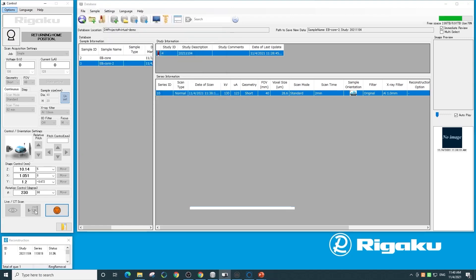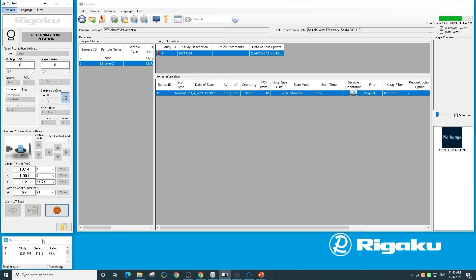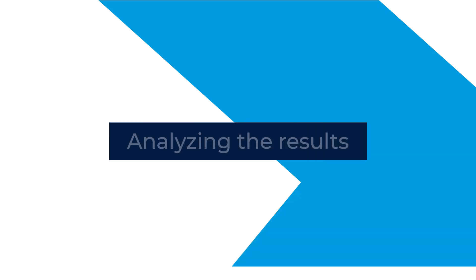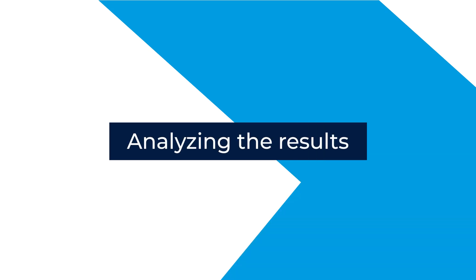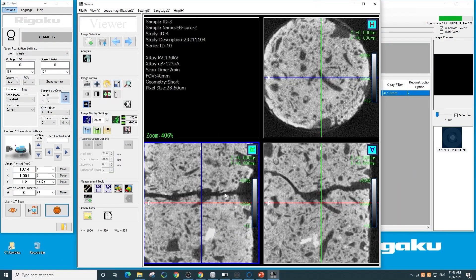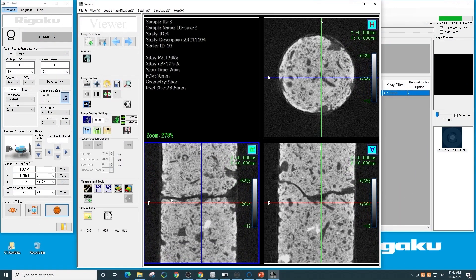The scan is now finished and the sample stage is returning to zero degrees. In the bottom left you'll see that reconstruction is starting. Once the reconstruction is finished, we can start to review the results. I'm going to open this in an interactive mode so we can zoom in and see the crack in this drill core across several 2D cross sections.